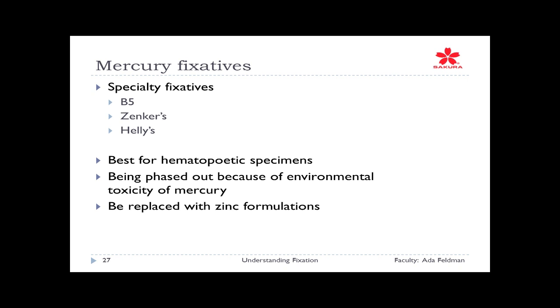There are special fixatives out that allow you to do fixation on the microwave processor. The majority of those are actually using glyoxal or alcohol. They're not using formalin, because that's the one thing you don't ever want to be microwaving, because we know what the vapors of that molecule are like at room temperature. You can just imagine how it would literally knock you out if you had heated that.